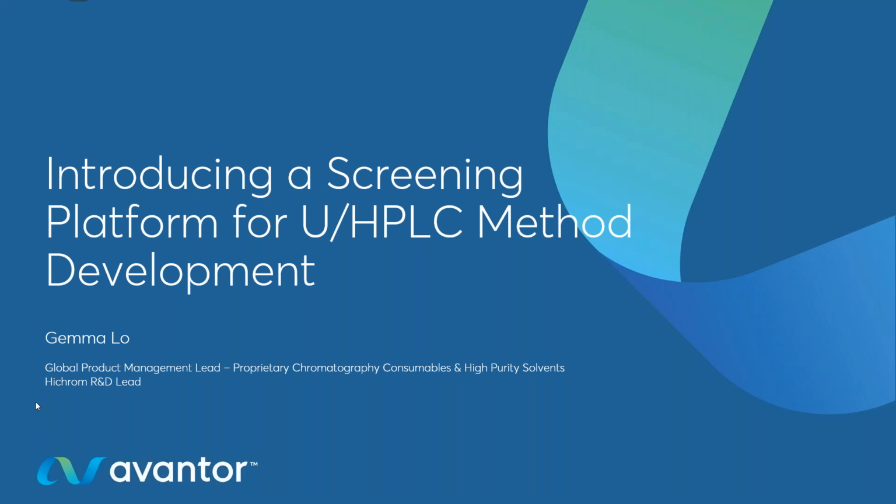So hello and welcome to this webinar. Today we're going to be talking about a screening platform for method development. We're thinking about the parameters to maximize selectivity and really an optimized and systematic approach to method development. So how can we do it more quickly, get a lot of information, and develop good methods within that selectivity space. It builds on what we've talked about in the previous two webinars. If you haven't watched them, you can go back and watch the recording. If you have, then you'll know from the start what I'm talking about.